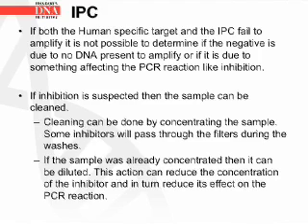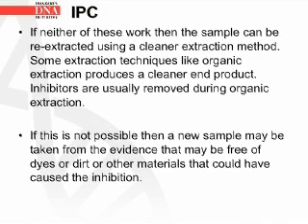Cleaning can be done by concentrating the sample. Some inhibitors will pass through the filters during the washes. If the sample was already concentrated, then it can be diluted. This action can reduce the concentration of the inhibitor and in turn reduce its effect on the PCR reaction. If neither of these cleaning methods work, then the sample can be re-extracted using a cleaner extraction method.